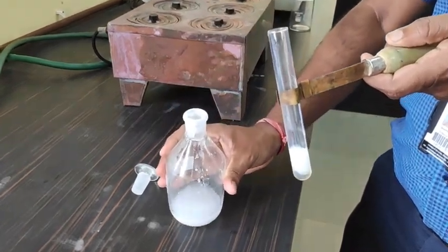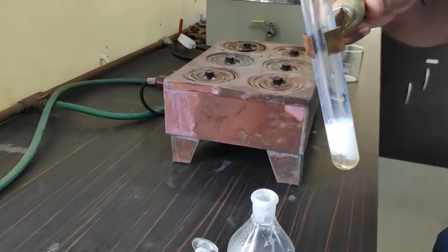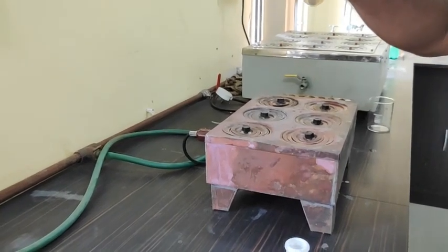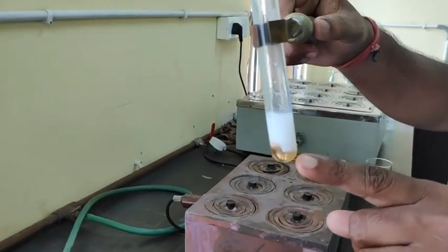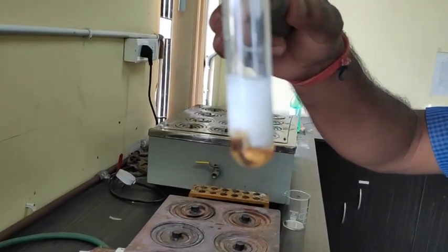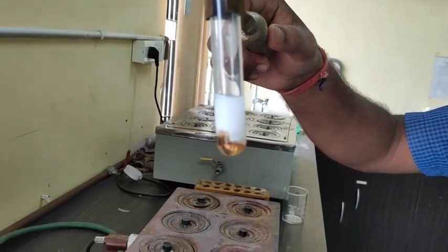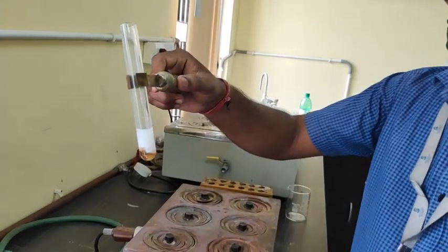Now as soon as he added some lead acetate, a huge amount of precipitate has occurred. Now we need to know whether it is a brown or black type of precipitate. Now yes, as he is showing us, there is a distinct change in the color, and the color is now going brown. So we can now say that this test has been confirmed for sulfide.